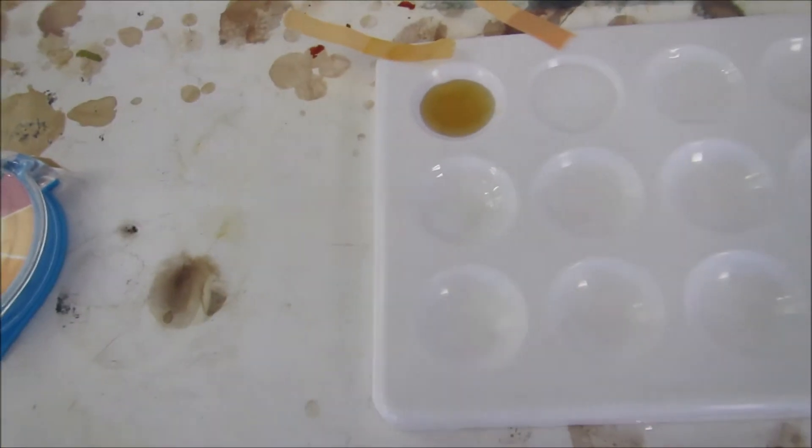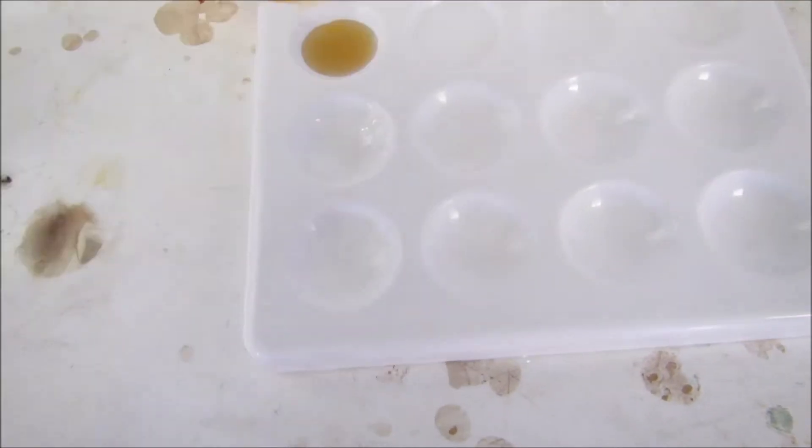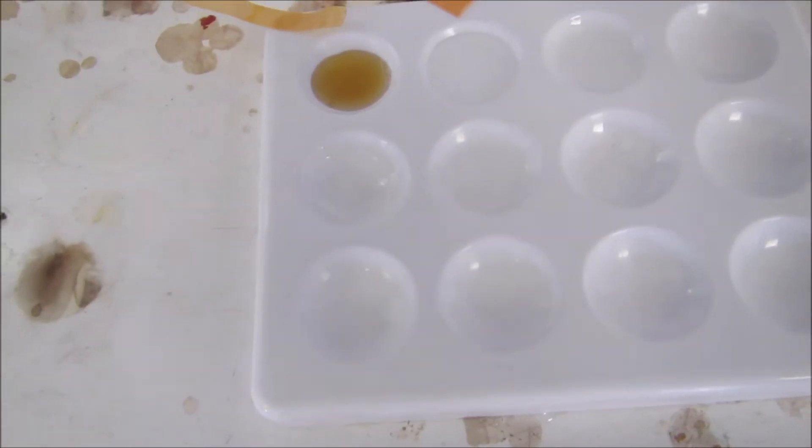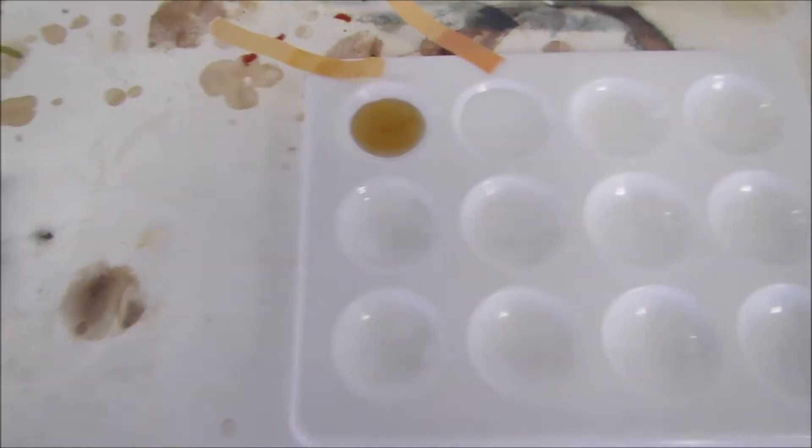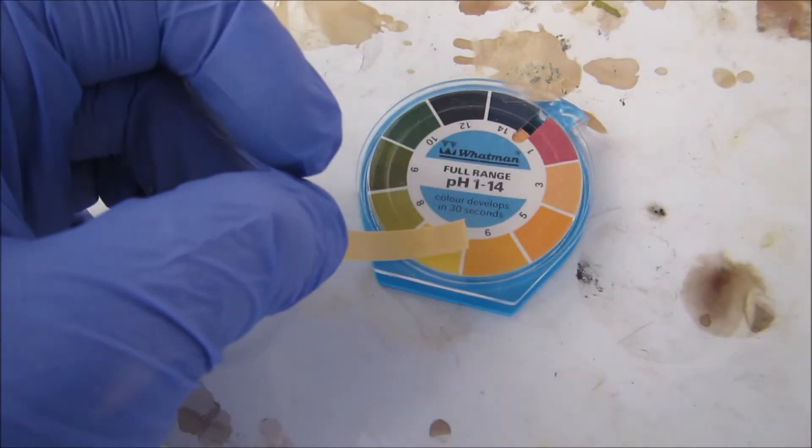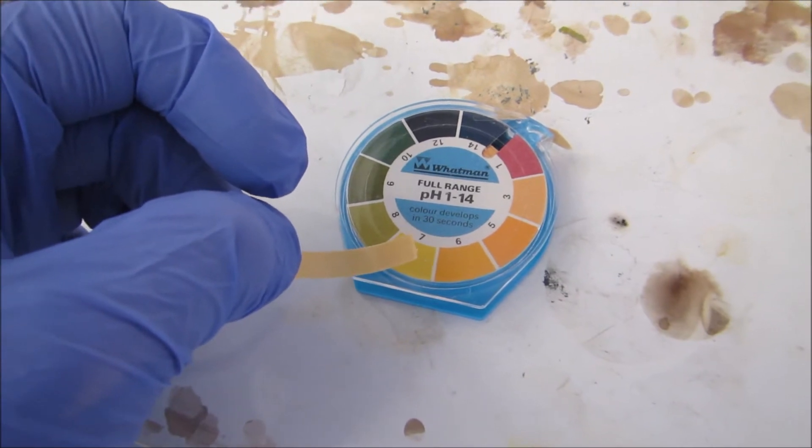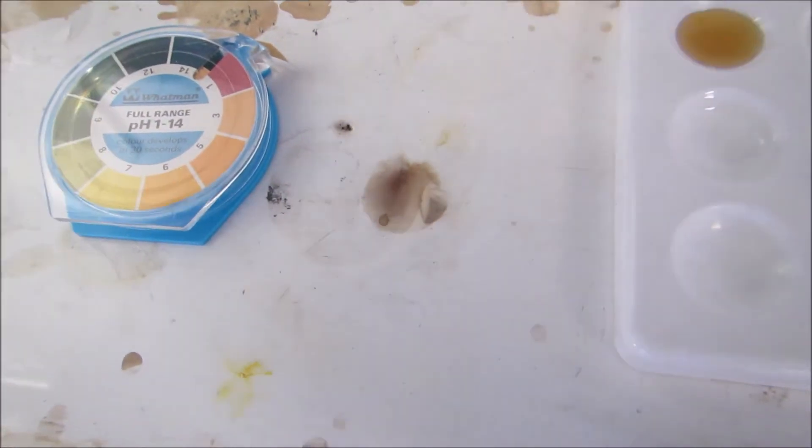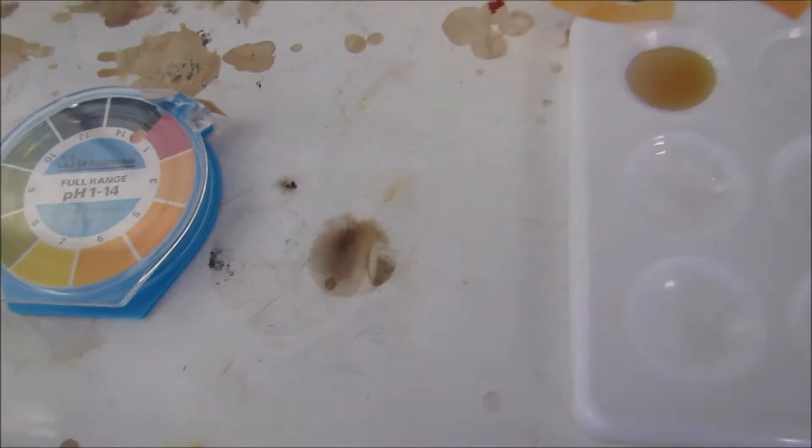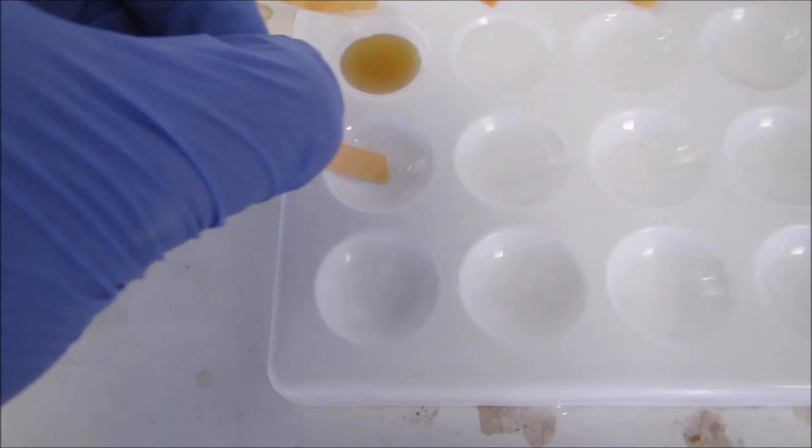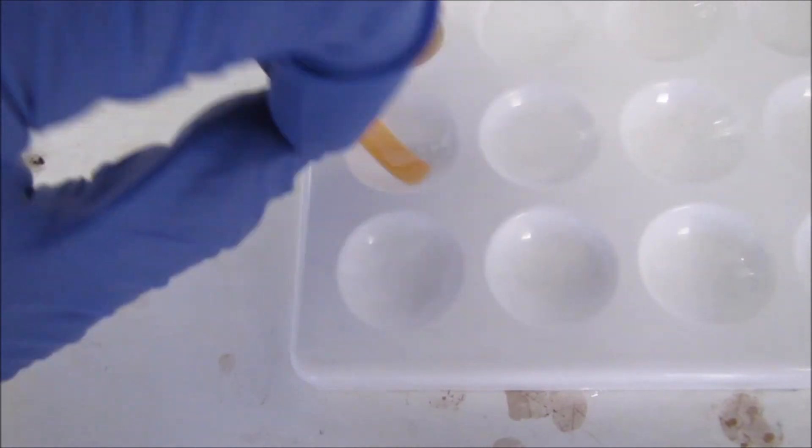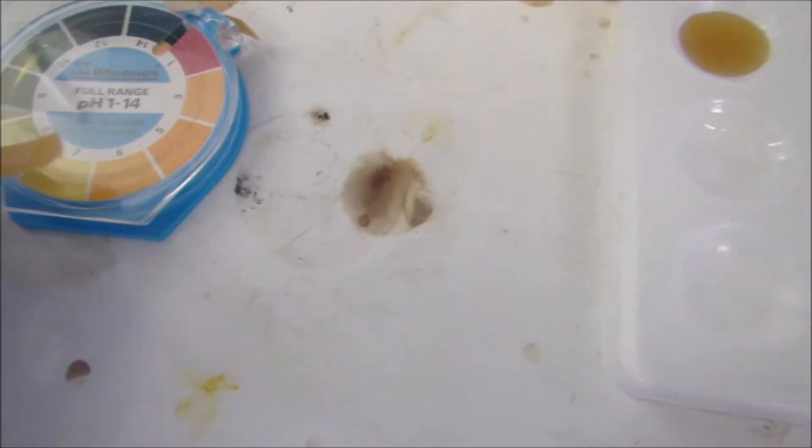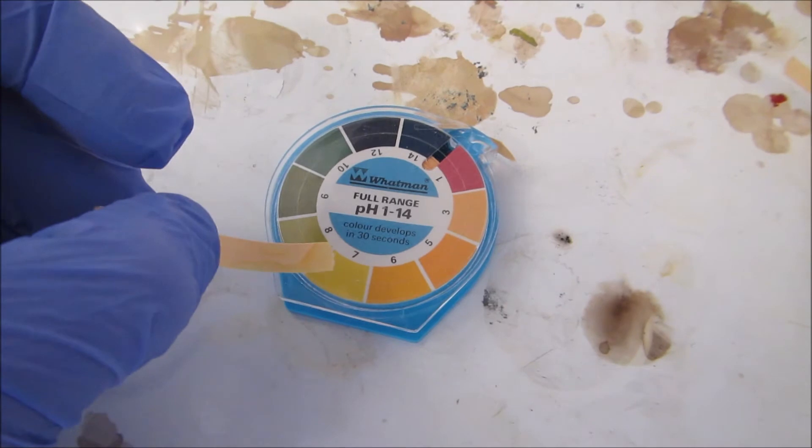The one after is our ketone. Our ketone is around pH 7, so neutral. Fourth one is our aldehyde and again it's coming out around neutral.